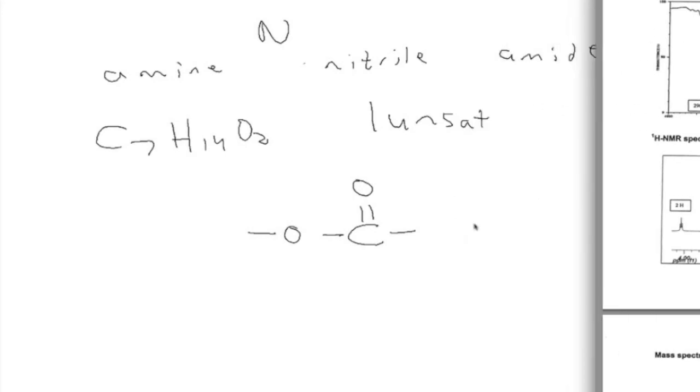Now, what goes here? What atom goes here? On a carbon, your guess. It's got to be a carbon. What else could it be, right?